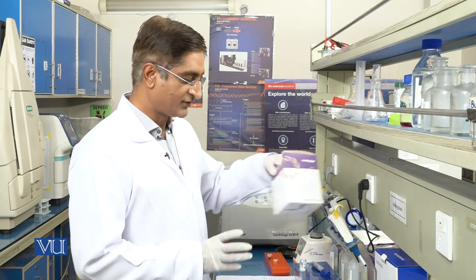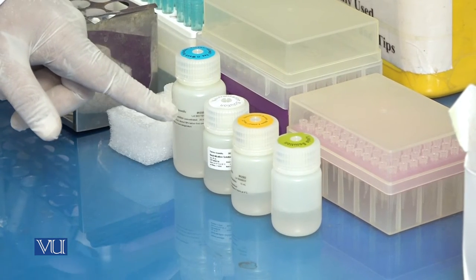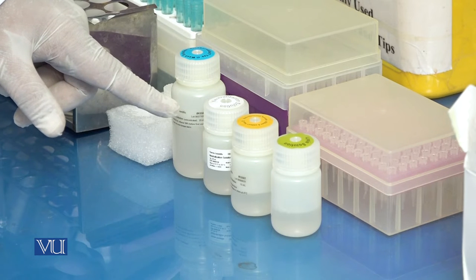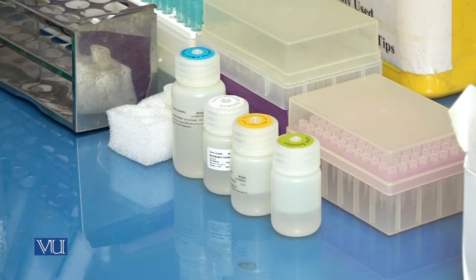We will use the Thermo Scientific GeneJet plasmid miniprep kit. These are the solutions present in this kit: lysis solution, resuspension solution, neutralization solution, and wash solution. These solutions will be used in different steps. In the first step, we will add 200 µl of resuspension solution.